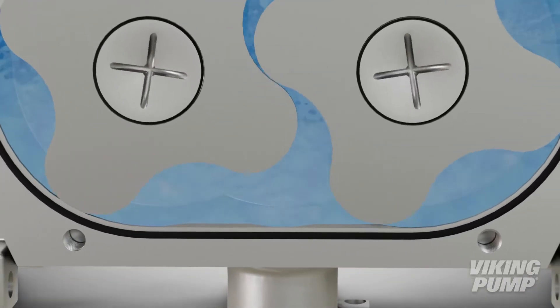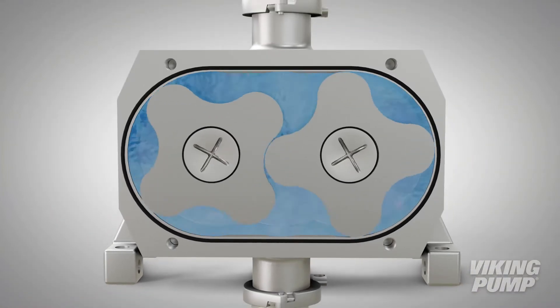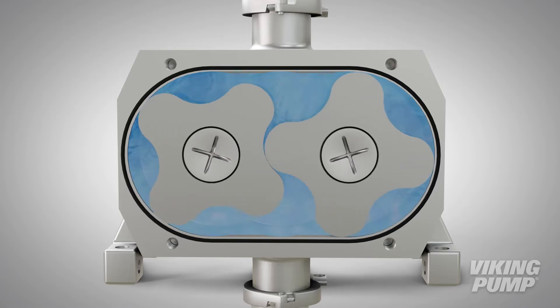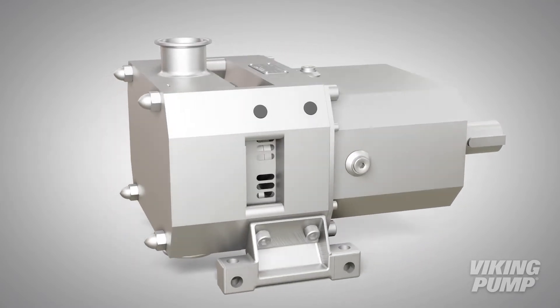With this highly efficient design, process fluid can be recirculated without causing damage to proteins or other biologic media, making this series ideal for demanding applications such as tangential flow filtration.